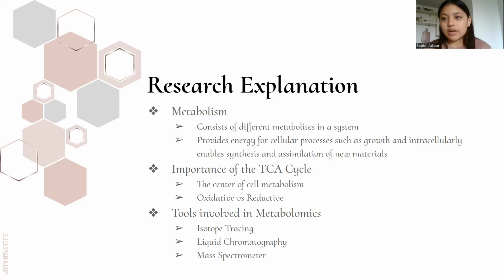Liquid chromatography and the mass spectrometer work together because they help analyze metabolism and metabolic pathways. Specifically, liquid chromatography extracts compounds from the mixture and injects these pure compounds into a column. When the pure compound exits the column, it records its retention time, while the mass spectrometer evaluates these pure compounds based on their mass-to-charge ratio.